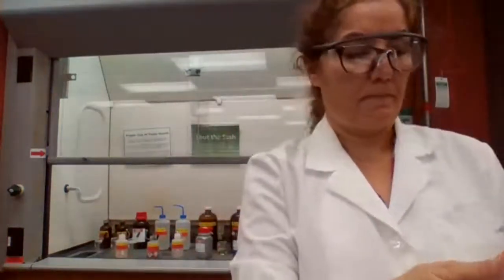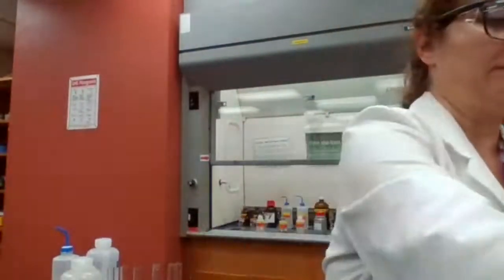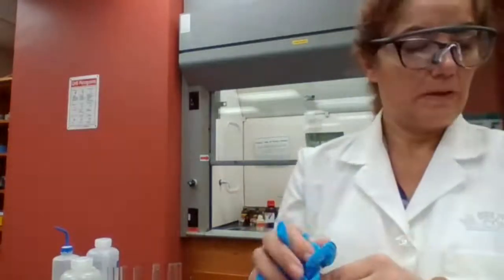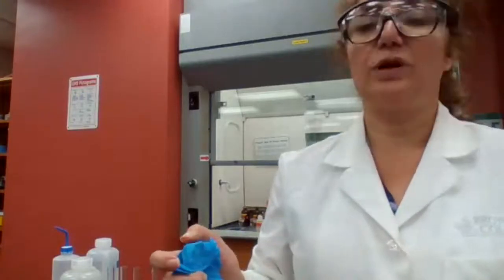Can you look at page 221, chemical reaction, and tell me why adding HNO3 is going to dissolve the precipitate? Can you tell me that? Addition of HNO3, either on page 221, hard copy, or 219.